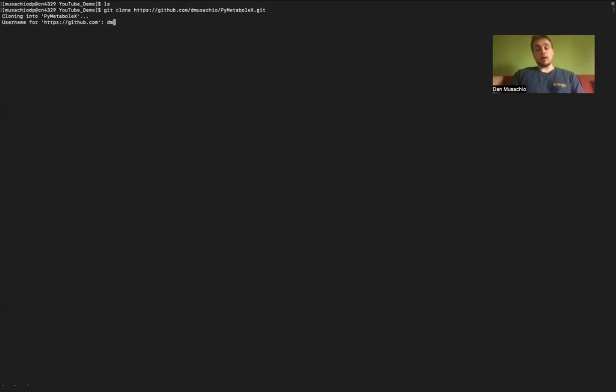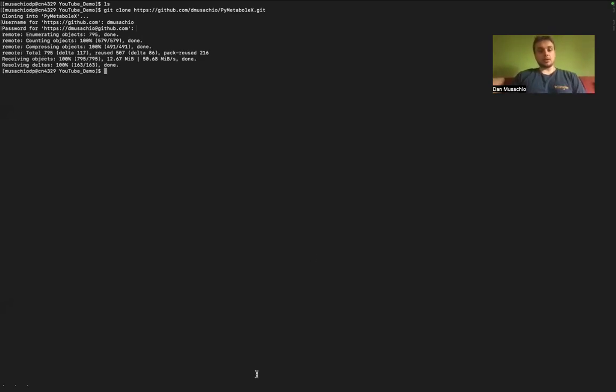Of course, you're also going to want to be added to the GitHub. At the moment it's private, but feel free to email me. I'll provide my email at the end. So you just type in your username and then your key. I explained in my GitHub how to set this up. So it's pretty standard.